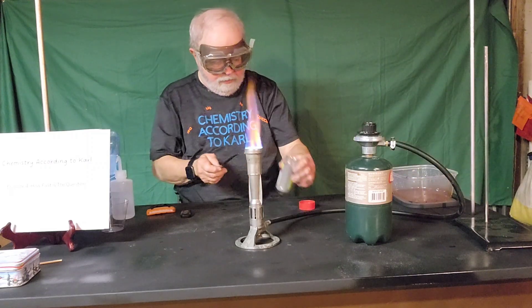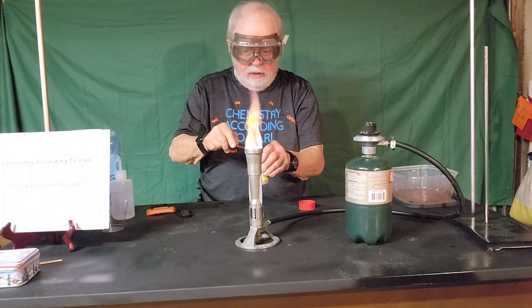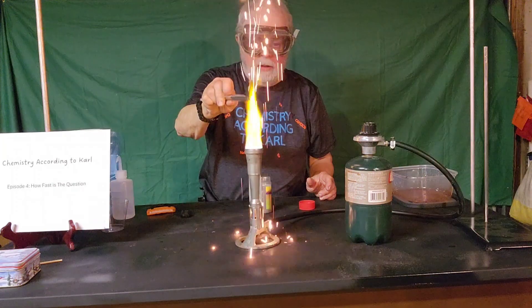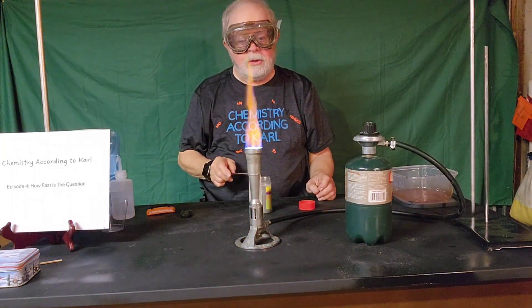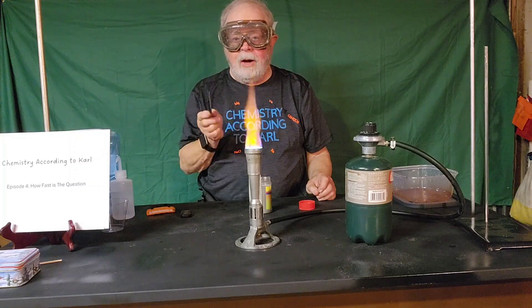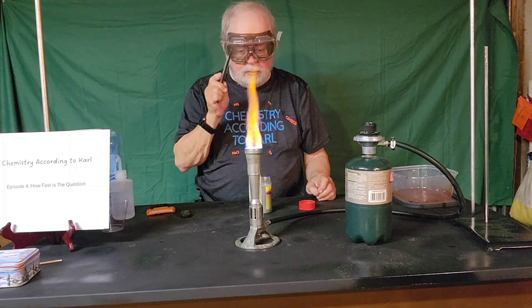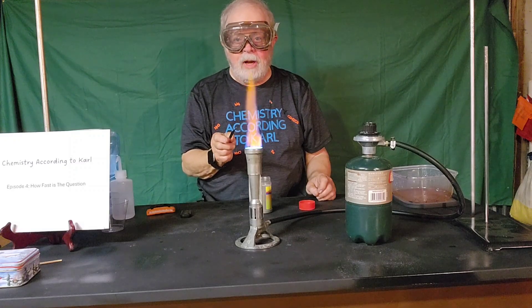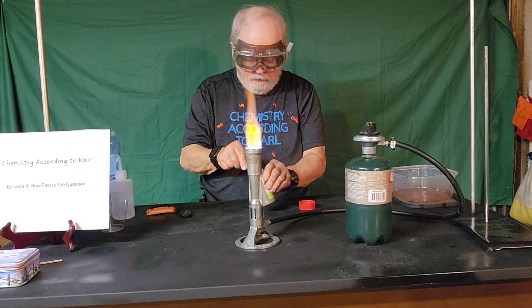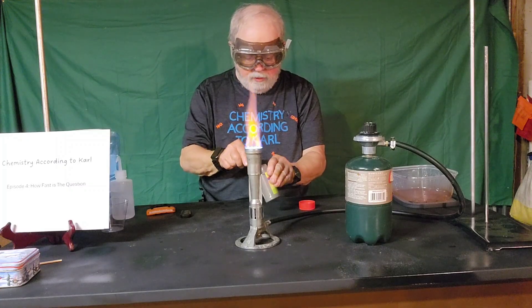I'm going to take some more iron here — this is powdered iron — and we're going to tap it in the flame and see if we get anything different. Oh yeah, just a little bit of difference! The speed of the reaction of iron with oxygen in the air at high temperature goes really, really fast if the iron particles are really small, like in this iron powder. We'll do it again just for grins because it was fun.